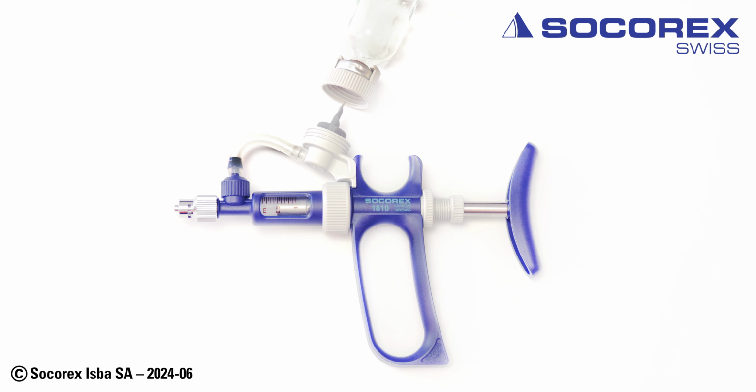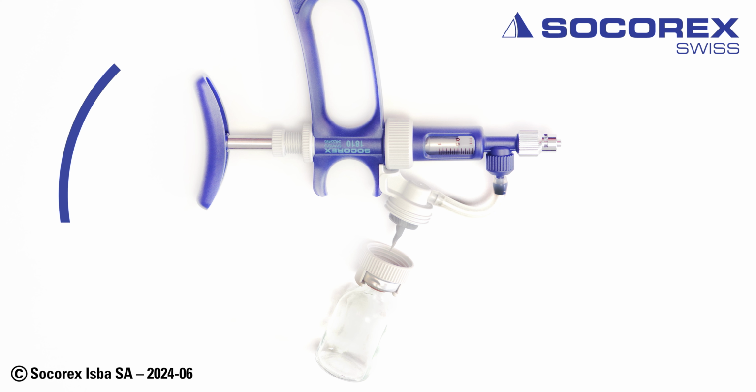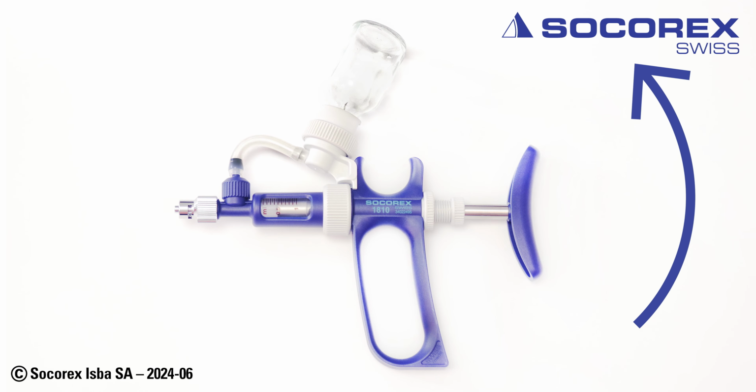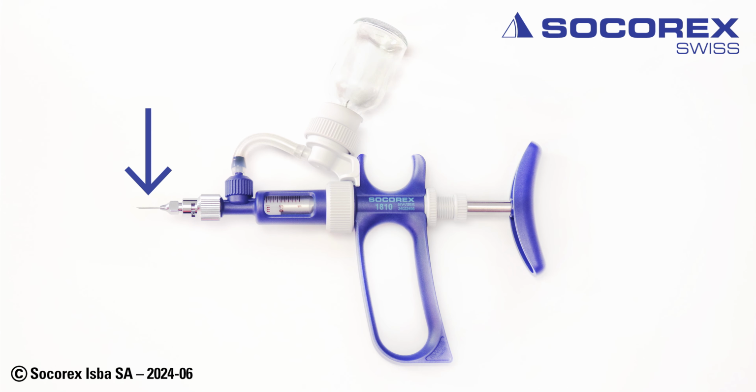Insert the bottle into the lock. Flip the syringe and pierce the septum with the needle. Screw the bottle lock. Put the syringe in an upright position and tightly lock the bottle. Attach an adequate luer lock needle and you're ready to start.